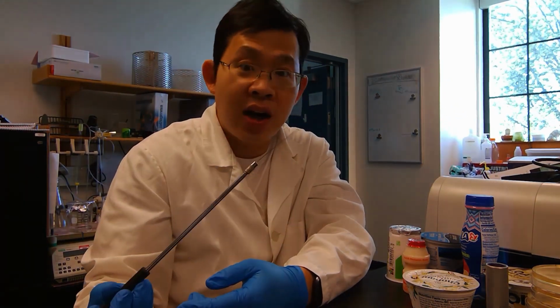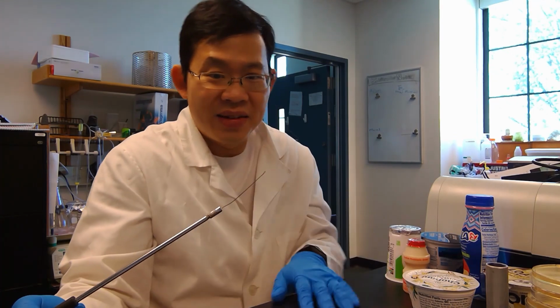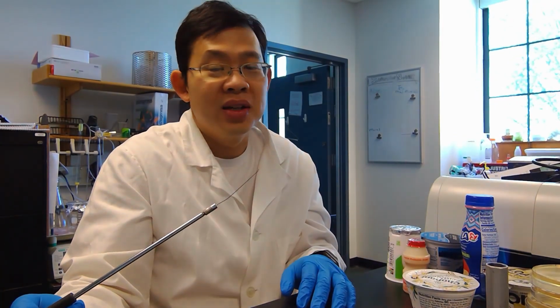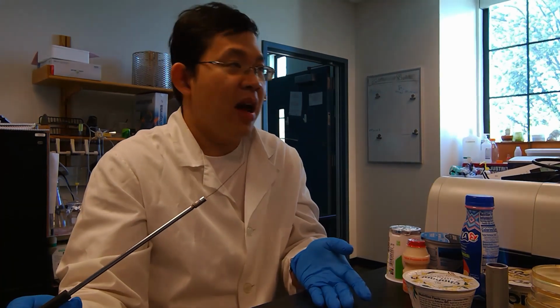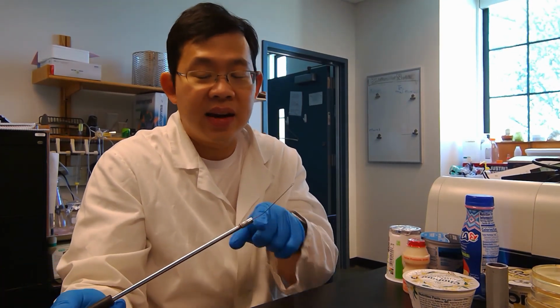Okay, so this is hot. You don't want to touch it with your hand, and also you don't want to leave it on the table, because guess what? Your table, even though you disinfect it at the beginning of the class, has things drop from the air, from everywhere. So it's never a good practice to leave the sterilized loop on the table. Okay, so now let's take our sample.